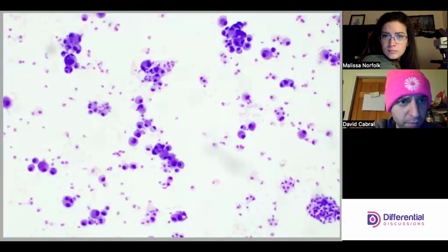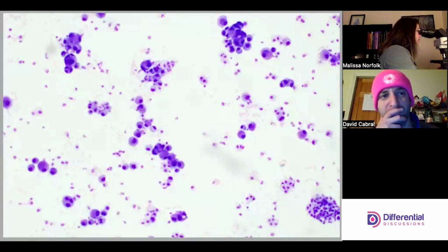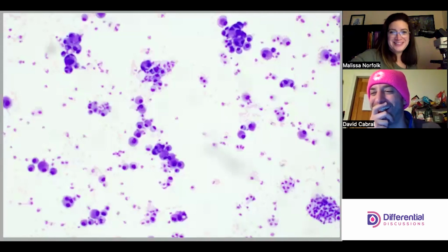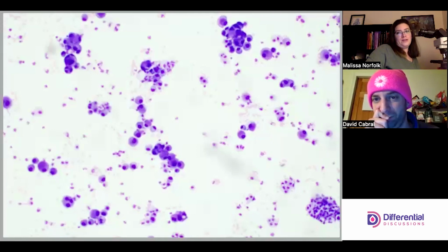Yeah, look at these guys up here. Not good. There was a guy too. I'm debating where it is. I'm trying to see where it is spatially from the scope onto here. That's challenging. Melissa always has the hard job. She's got eyes on the scope and on the video camera, and going back and forth is difficult. I think it might be just out of field. Let me pull it up.